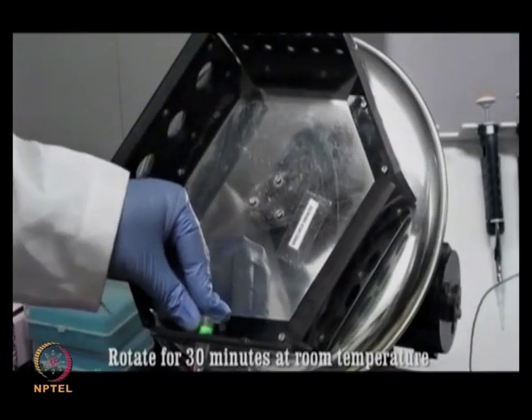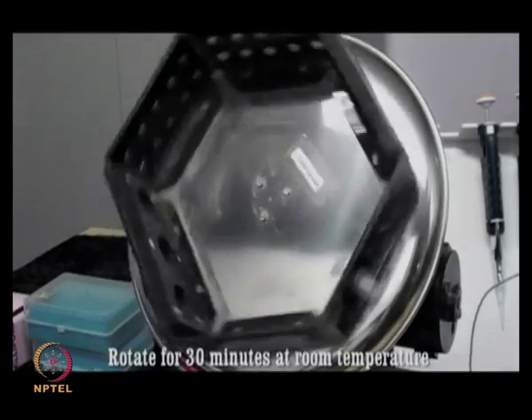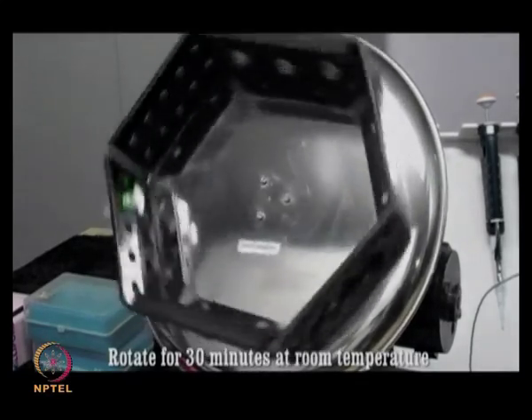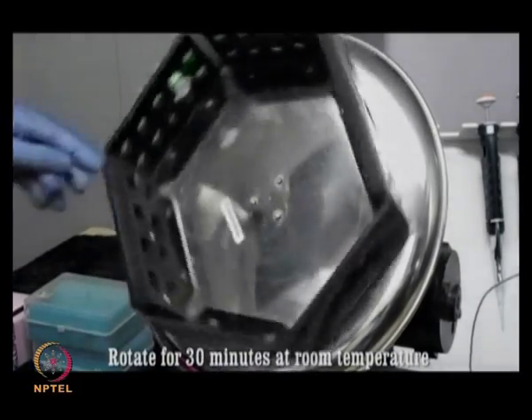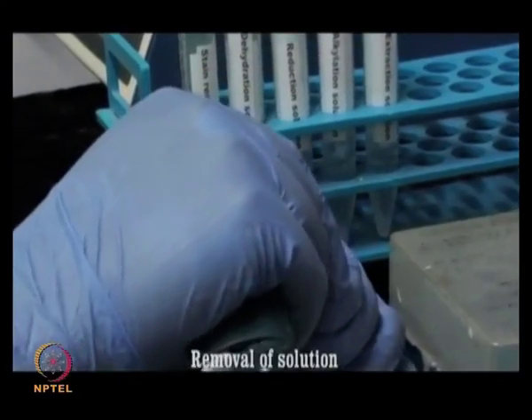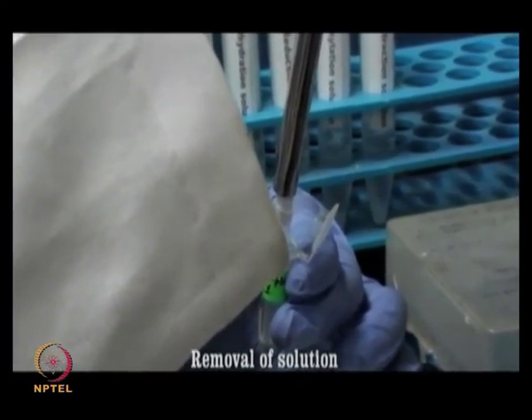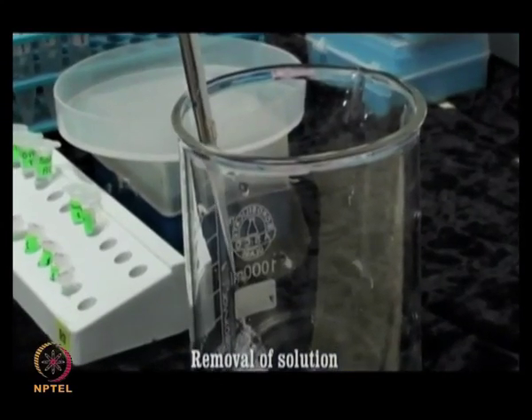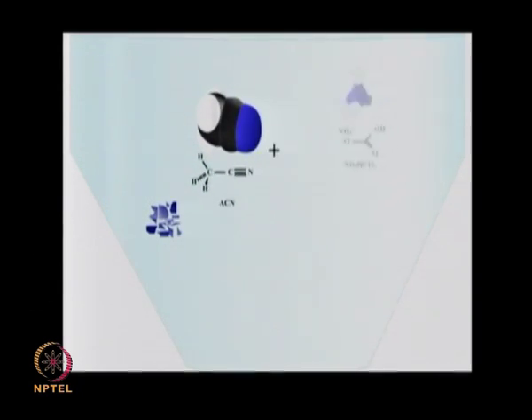After addition of the stain removal solution, rotate it on a shaker for 30 minutes at room temperature for complete removal of the stain from the gel pieces. It is recommended that you change the solution after every 10 minutes. By changing the solutions and removing it after every 10 minutes, the Coomassie brilliant blue stained gel pieces become colorless.